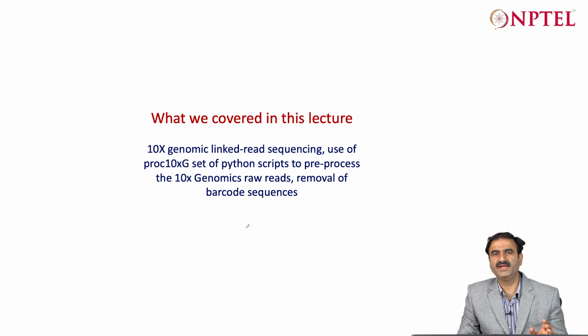At the end we saw a few examples where both linked reads and long reads were used to assemble genomes, and what the net N50 and BUSCO score, or genome completeness status, was after combining the different methodologies.